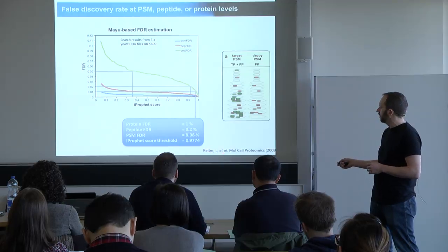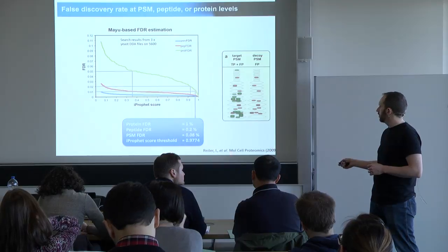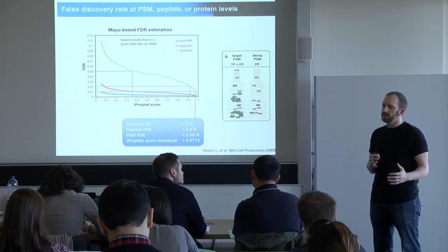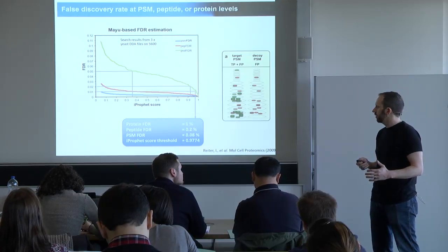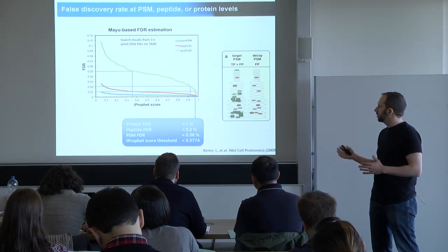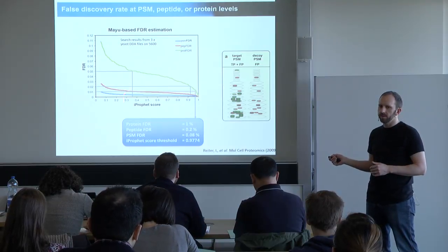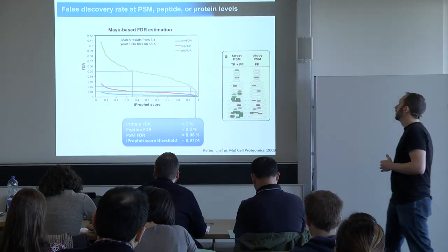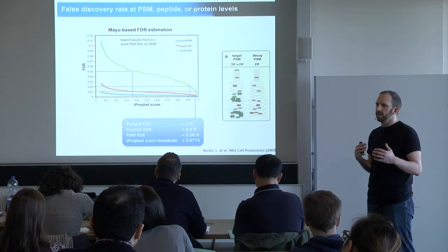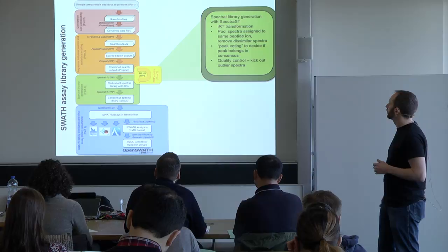If you're interested in these kinds of issues, there's a paper from Lukas Reiter, now 6 or 7 years old, but this was an important step in DDA proteomics to realize that these errors were occurring at different levels. This relates to what Rudy said in terms of people reporting a lot of weird stuff in the early years of proteomics, and it wasn't really being evaluated in the proper way. So our suggestion is to take this into account also at the library stage, right? When you're creating your library, you want to make sure that it's reasonably high quality.